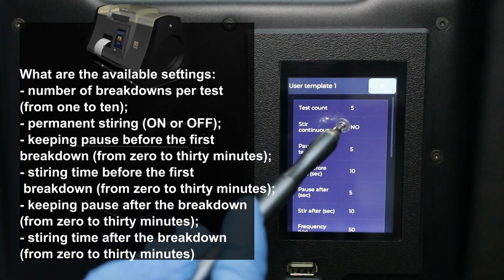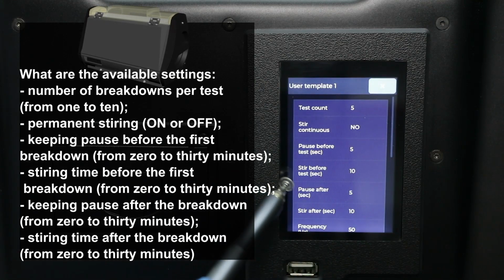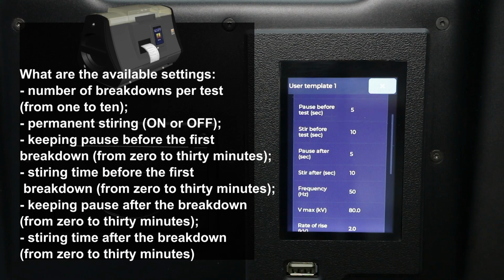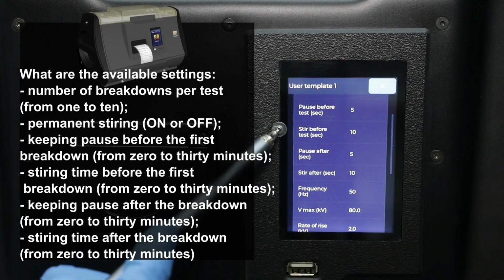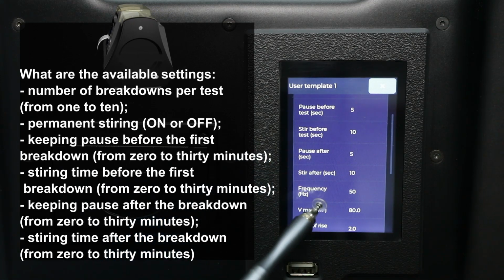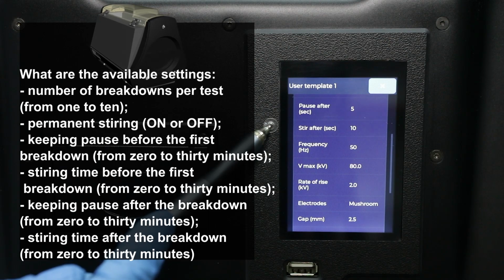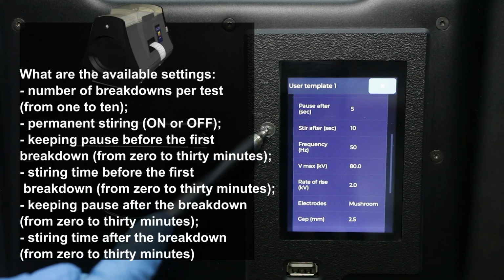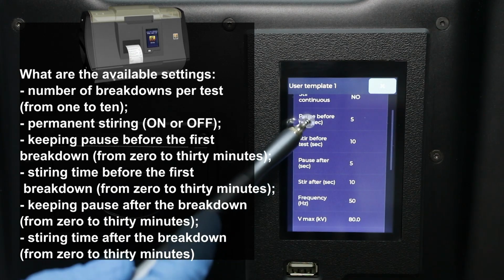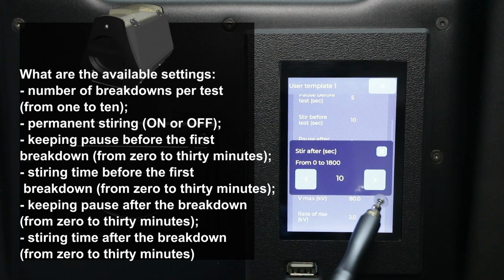Permanent stirring, on or off. Keeping pause before the first breakdown, from 0 to 30 minutes. Stirring time before the first breakdown, from 0 to 30 minutes. Keeping pause after the breakdown, from 0 to 30 minutes. Stirring time after the breakdown, from 0 to 30 minutes.